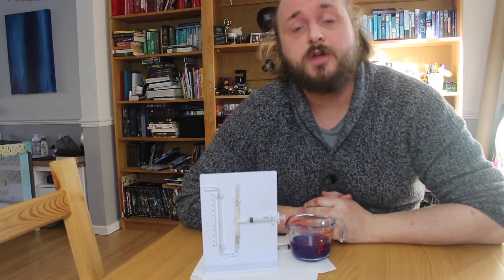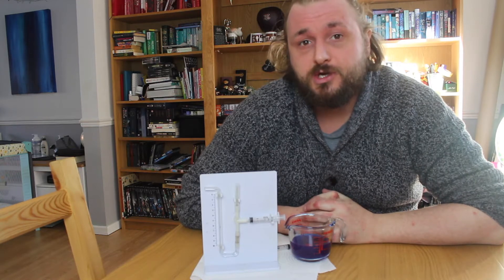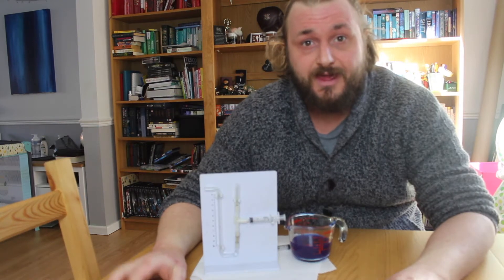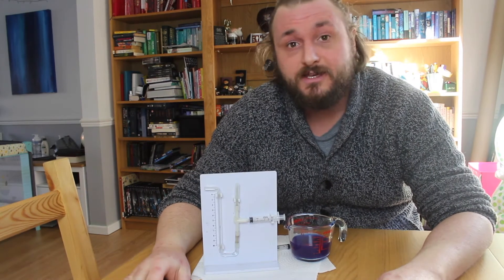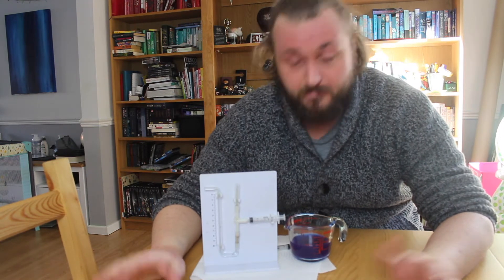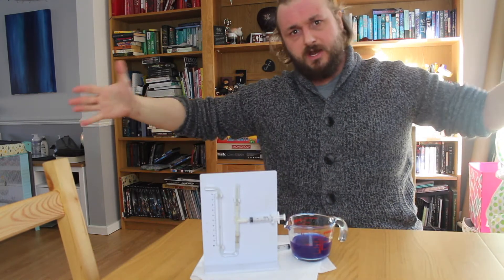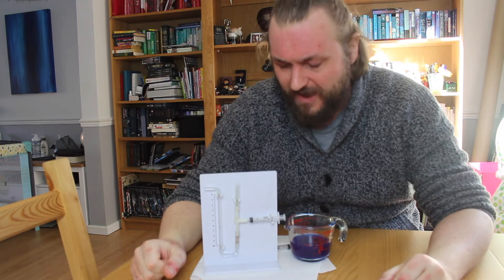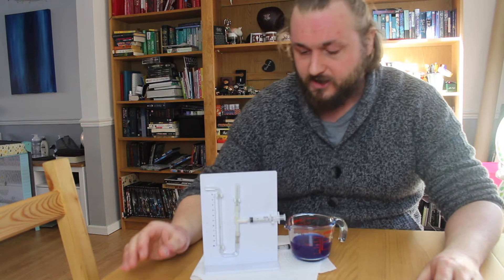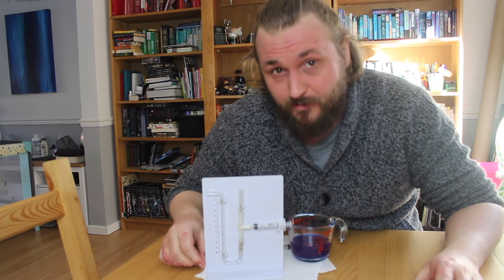This is a demonstration of what is called a potometer. A potometer is a device that you can use to demonstrate and to measure transpiration. This experiment is a key specified practical in the WJEC triple science course or the biology course for GCSE, but it may be useful for other exam boards as well. You may have seen a potometer before — they can have very large ones, normally with a big wooden block base and a very large graduated cylinder or pipe. This is a smaller version of the apparatus but it will do the same thing.